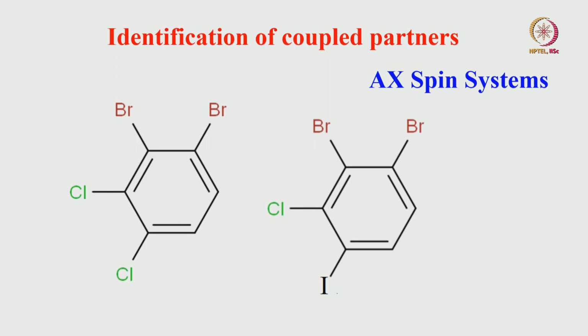It does not change. And I took the example of, let us say, 2 uncoupled spins. We get 2 peaks on the diagonal. Each of them corresponds to the identical chemical shift of the same spin in both dimensions. If I have 1 proton here, CHCl3, in both dimensions it gives the chemical shift of CHCl3. If I have another peak on the diagonal, in both dimensions it gives rise to the chemical shift of some other molecule. I explained to you about 2 uncoupled spins, and then I took the example of 2 coupled spins.